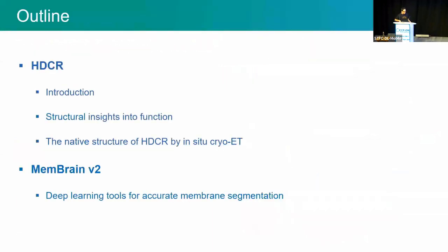So the outline of my talk is basically this. I will introduce HDCR and show you some structural insights into its function that we got using cryo-EM and cryo-ET. And then I'll present you the native structure of HDCR using in situ electron tomography. And in the last part of the talk, I will talk about the new version of Membrain, which is a deep learning tool that can do very accurate membrane segmentation.